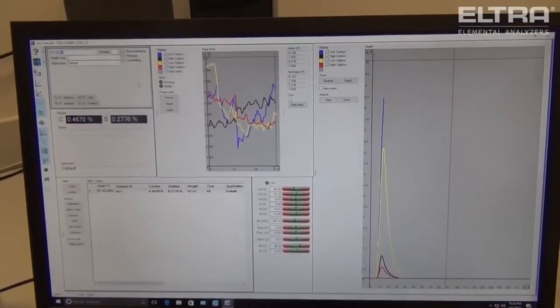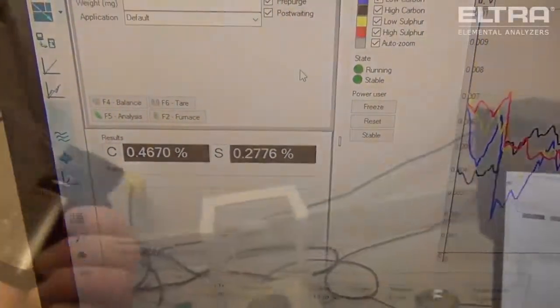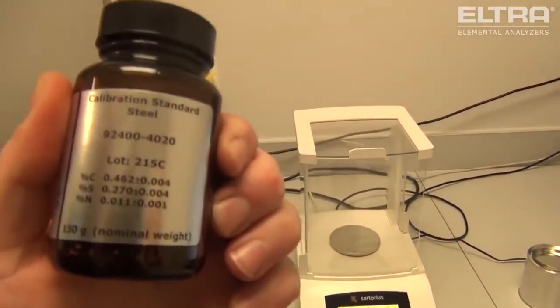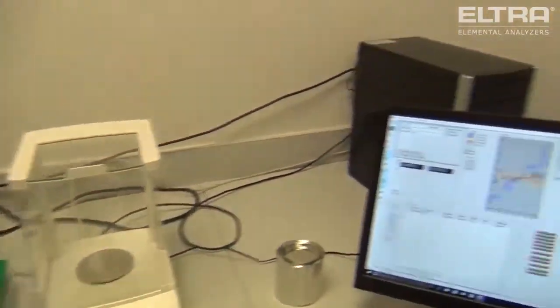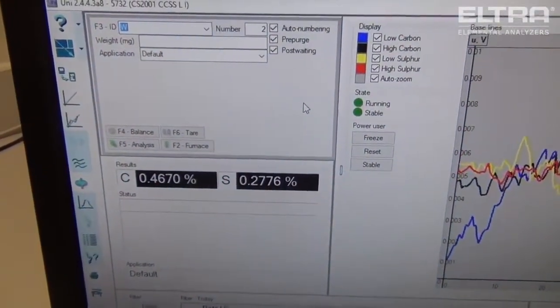Right here on the results screen, you can get the exact percentages in your sample. We were looking for 0.46, and we got 0.46. For sulfur, we were looking for 0.27, and we acquired 0.27%.